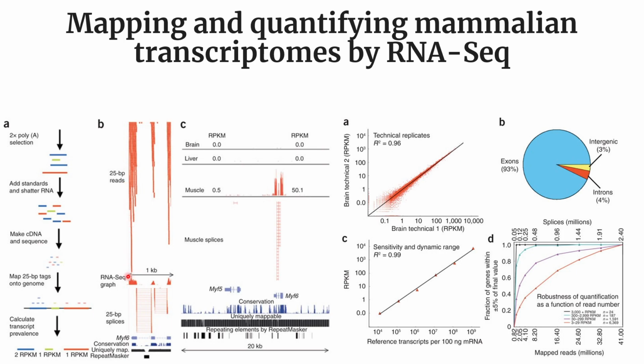We can see that this part of the gene has been analyzed more times compared to the other parts, and similarly the end part is also found to be more compared to the other part of this 1 kilobase sequence.